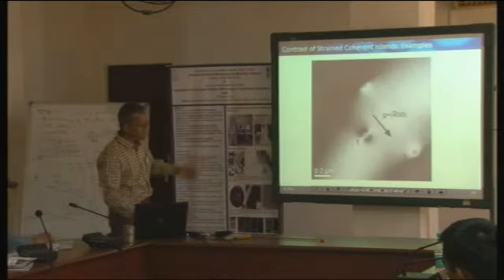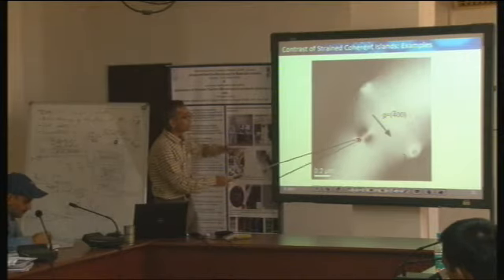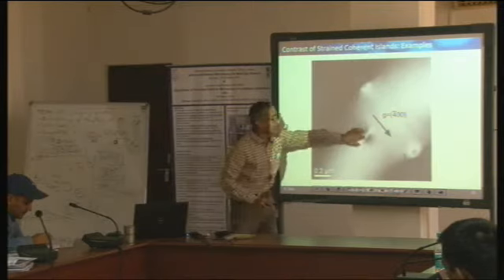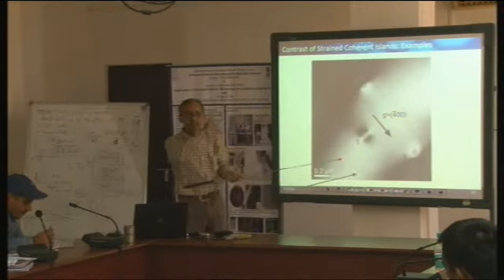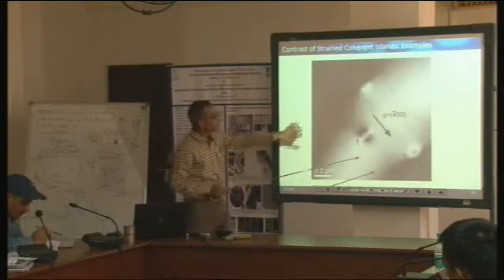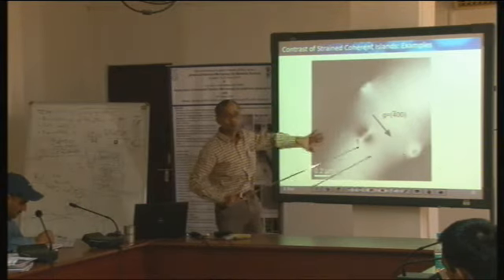I think there are some examples. So here the Bragg diffraction condition was such that you had a symmetrical one. In this particular area, the beam is falling throughout the sample. It is also a good example. At the very first I was trying to explain mass thickness contrast, isn't it? So it's a good opportunity. At this place, everywhere the electron beam is falling.